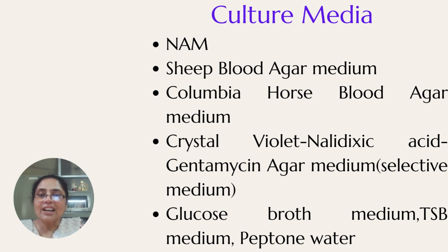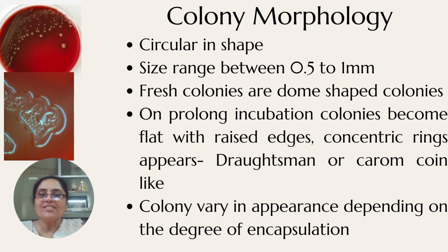In some broths it can grow. It will give an opaque appearance. Then we can know that yes, this is the organism of interest, that is Streptococcus pneumoniae is growing. Then you have to perform gram staining and see how it looks in microscope.